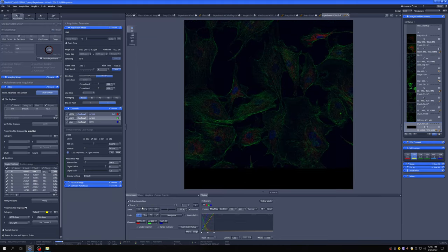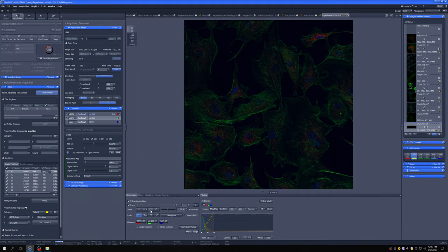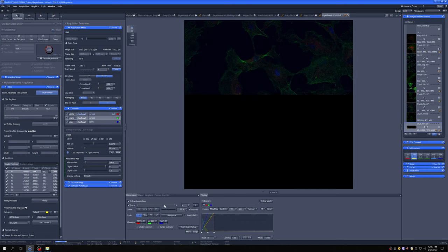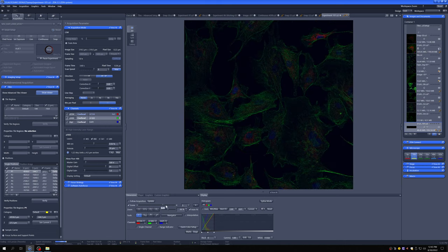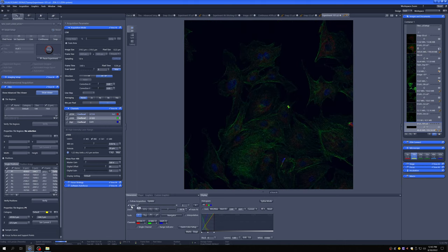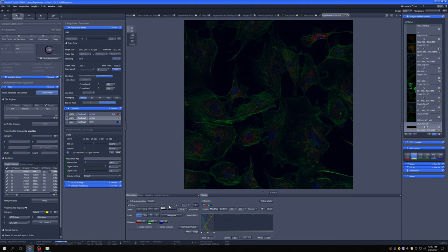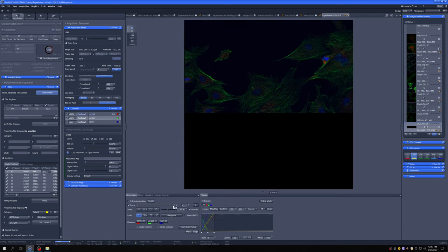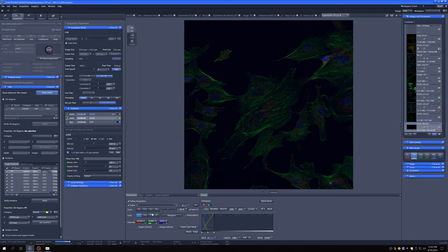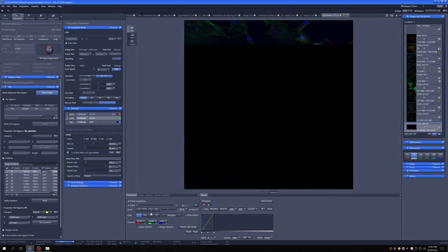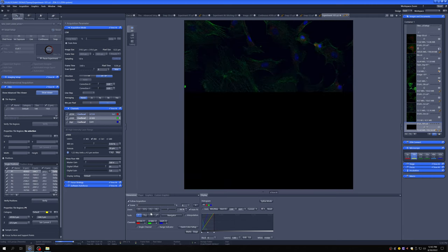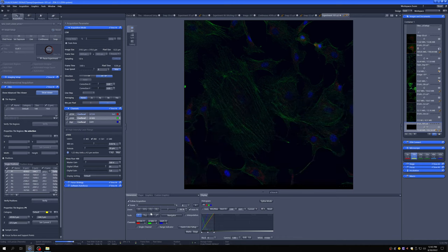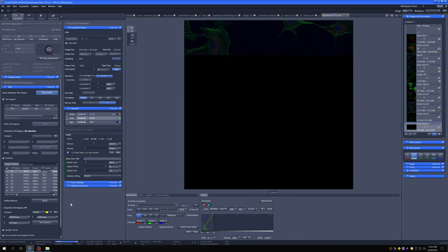And you can see that the positions are denoted by this scene slider. So we can look at whichever ones we want. And at the end of it, we'll have seven in-focus positions all taken automatically by the software once we've verified their Z.